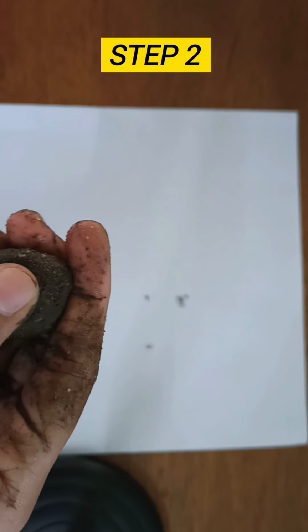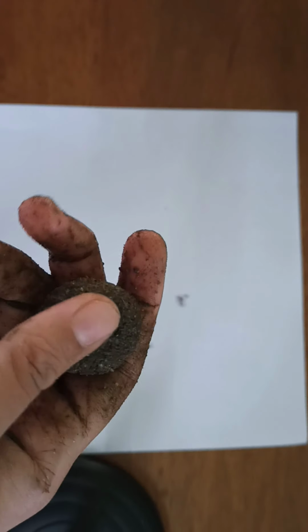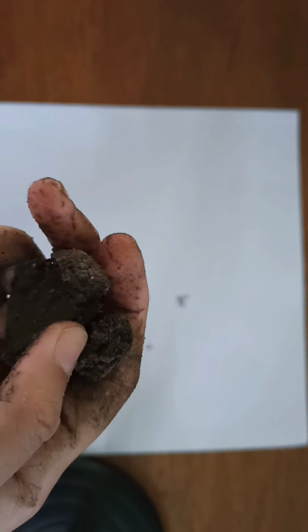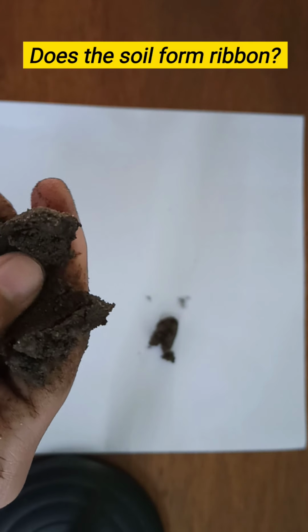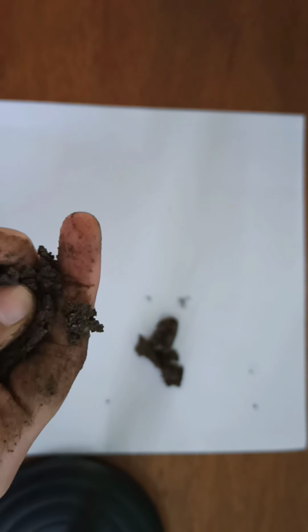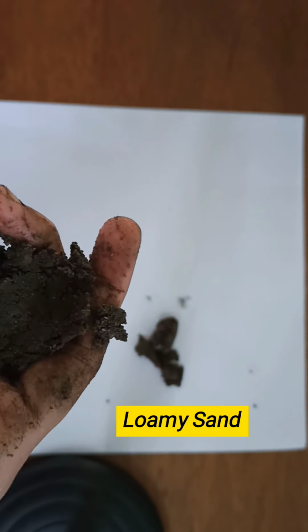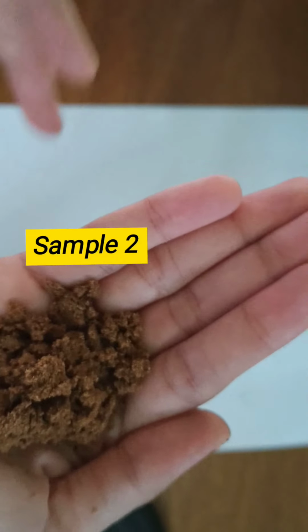For step 2, place the ball between your thumb and forefinger and try to push the soil with the thumb with the same pressure to form a ribbon. Okay, can the soil form a ribbon? No. If it's a no, so it's a loamy sand. So we are going to proceed with sample number 2.